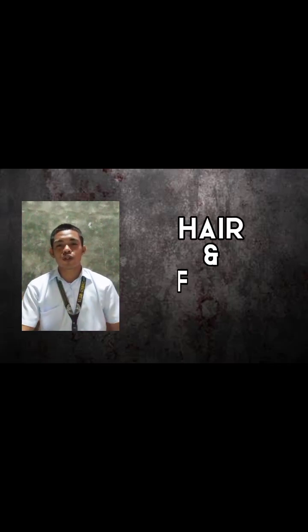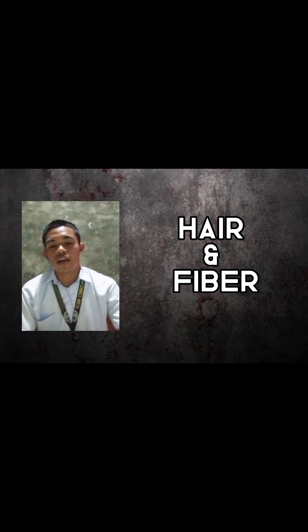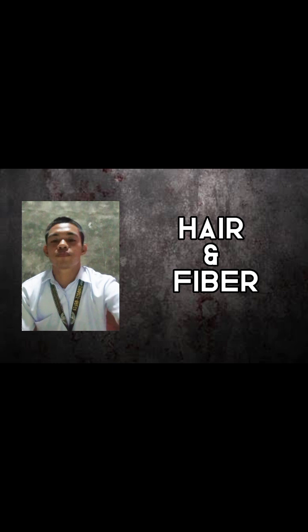Good day everyone. For today's video, I'm going to share our analysis with regards to hair and fiber under the microscope. But first, let us know what hair and fiber are.